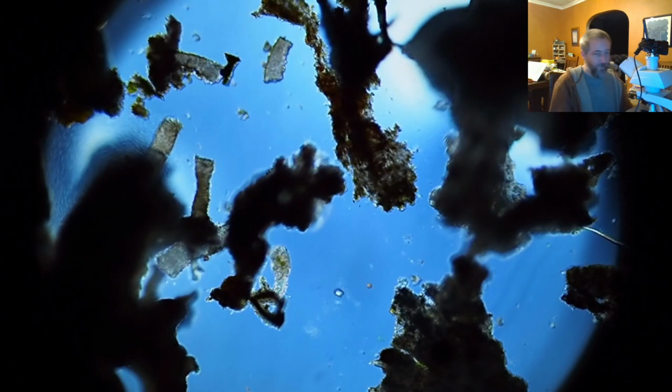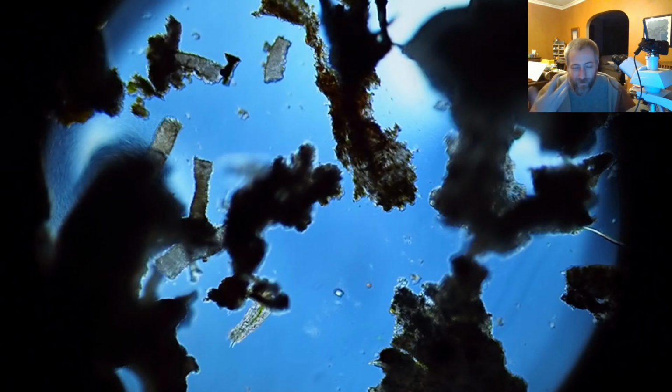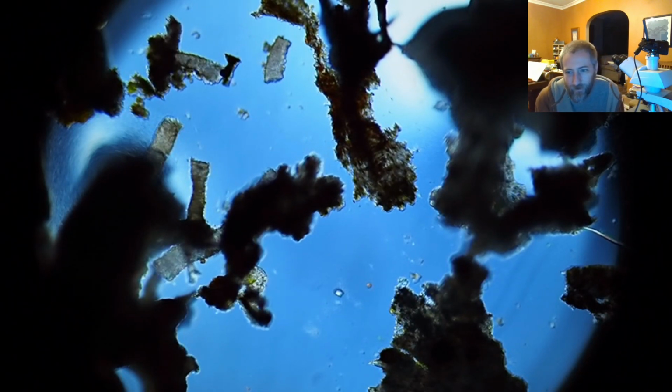After it came out of its mouth. But the rotifers and the water bears, I've never seen them actually interact with each other, other than bumbling across each other. So I don't know that they're necessarily enemies or friends. I guess I like to think of them as being friends. They're in the same environment a lot. They're probably not competing for nutrients, because the rotifers tend to be filter feeders. They have those swirling mouth parts that pull stuff in towards their mouth, and most of it just gets drawn in from wherever, and then they consume it or reject it. Whereas the water bears tend to be scrapers, or predators. They crawl around and then grab stuff.